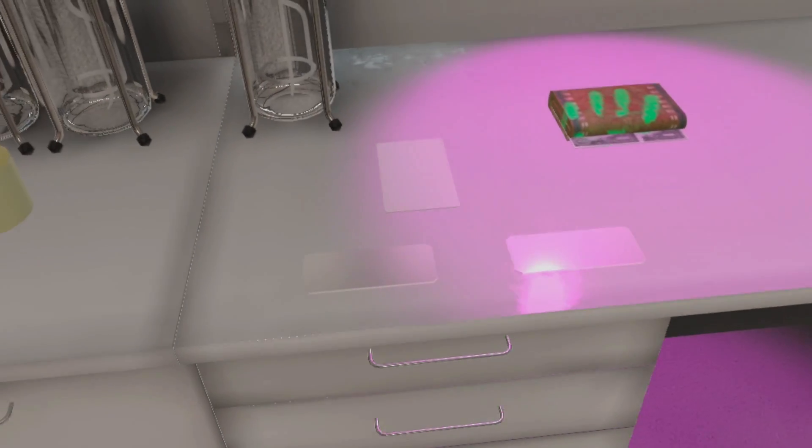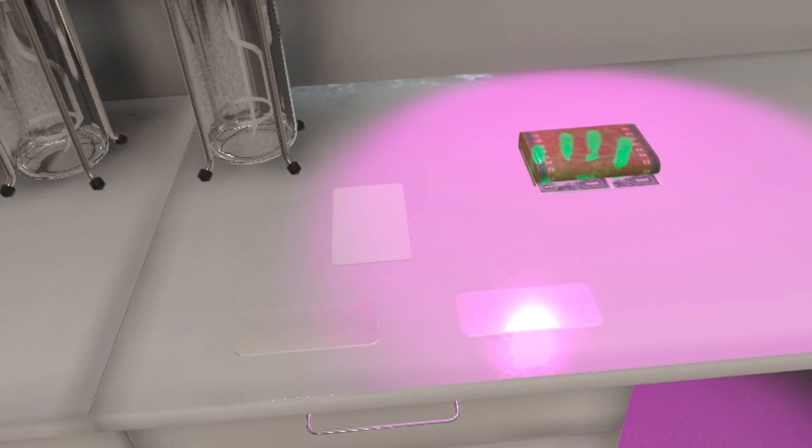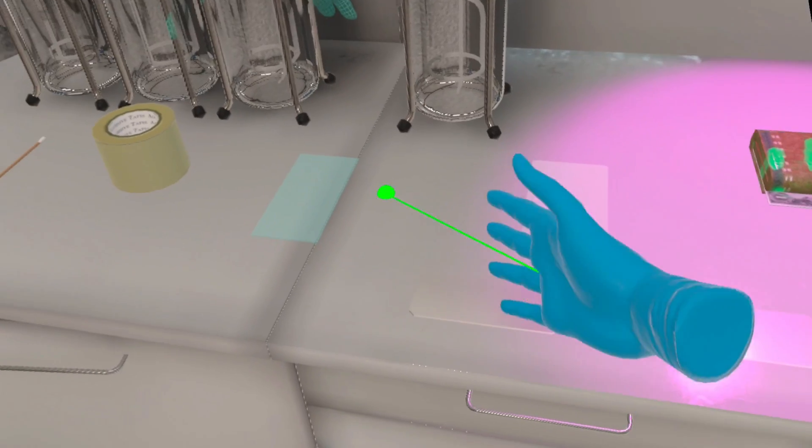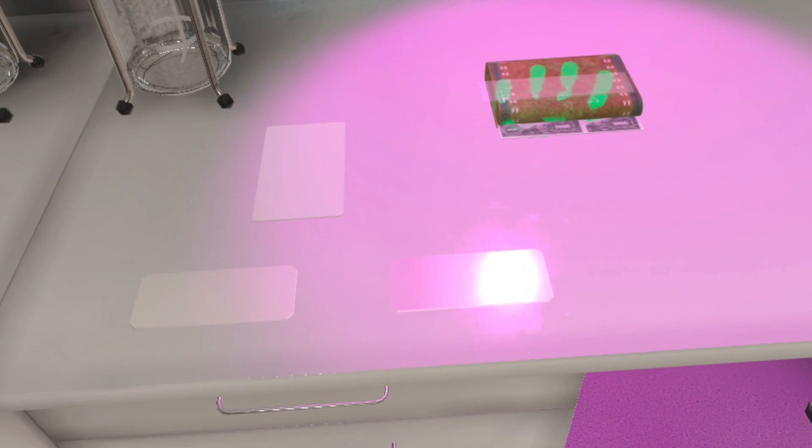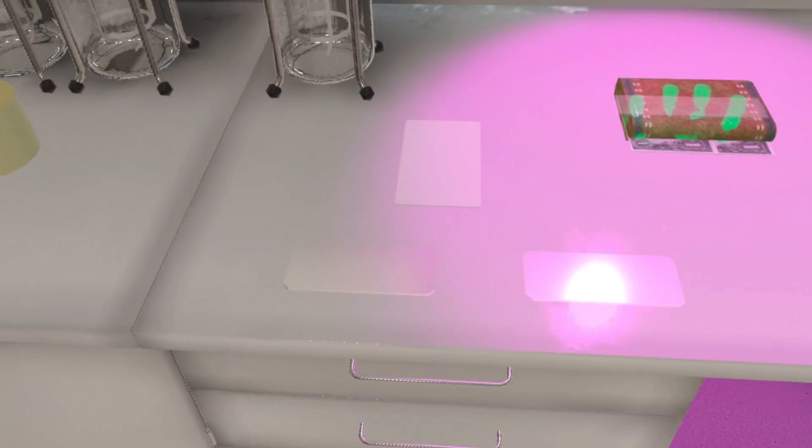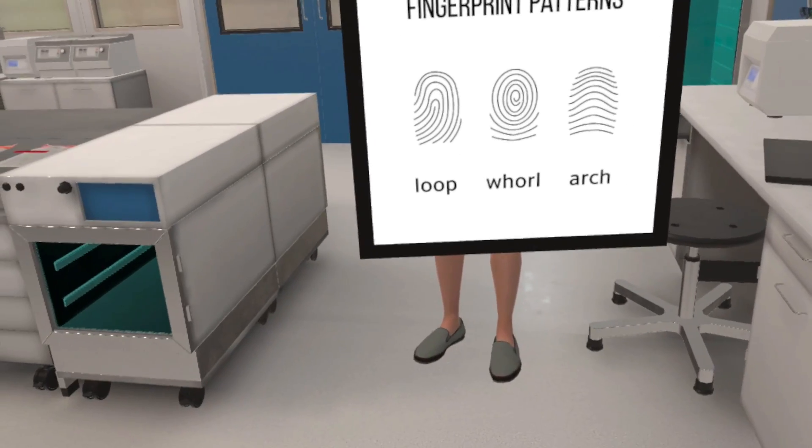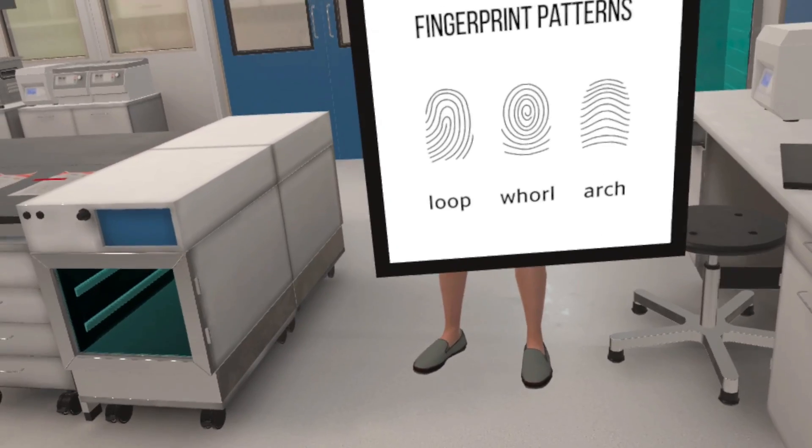Now take the adhesive tape and place it on the wallet to gently lift the visible fingerprint. It is also interesting to know that fingerprints are unique to each individual, yet they can be classified into three main classes which you can see in this image.